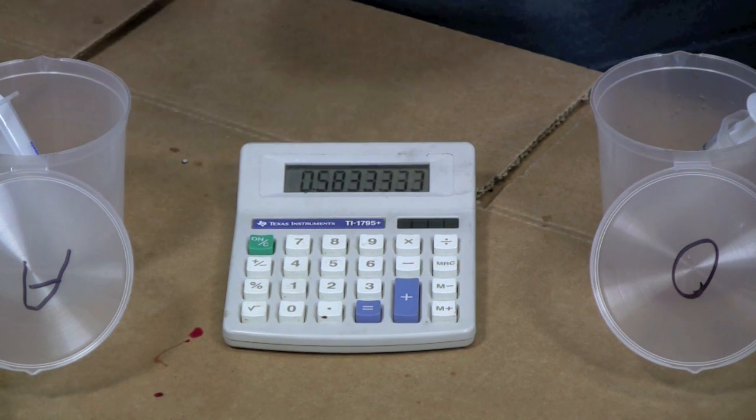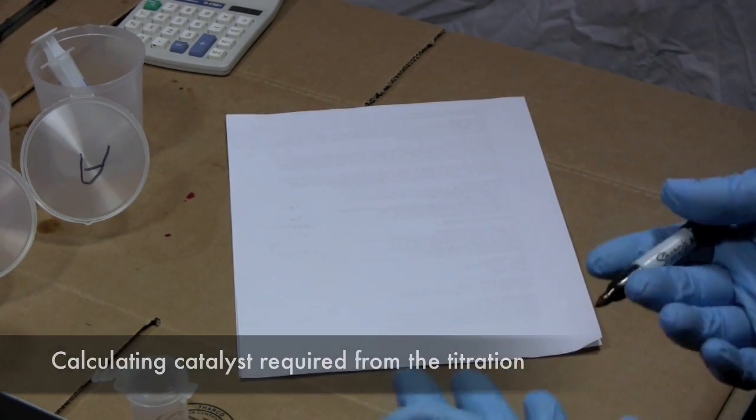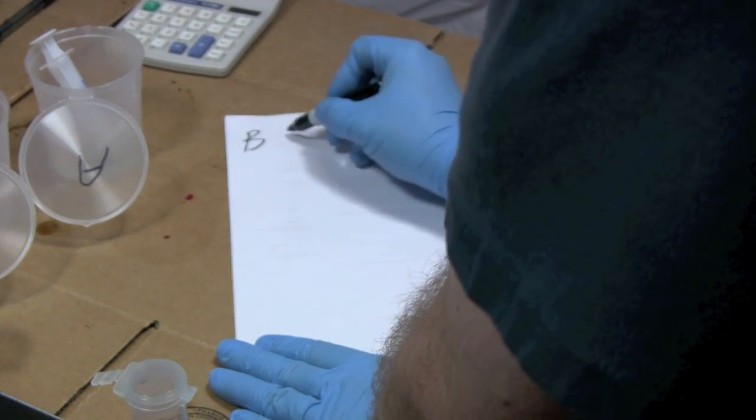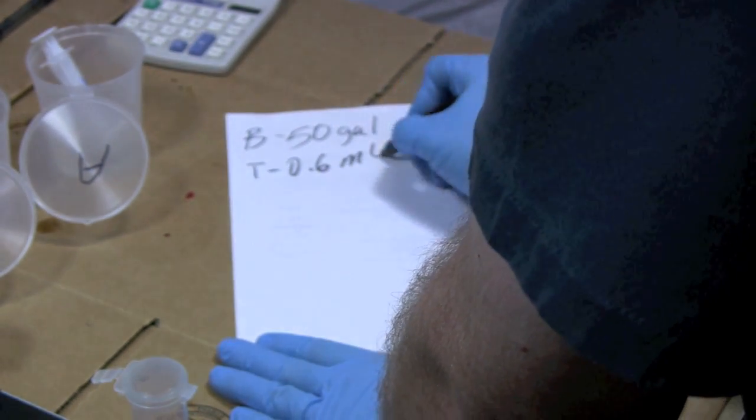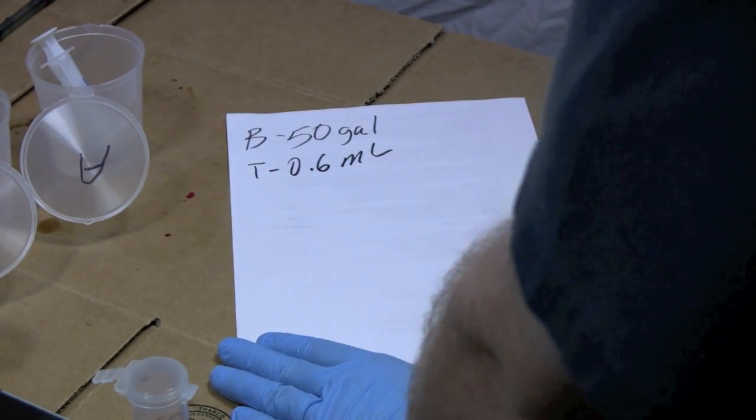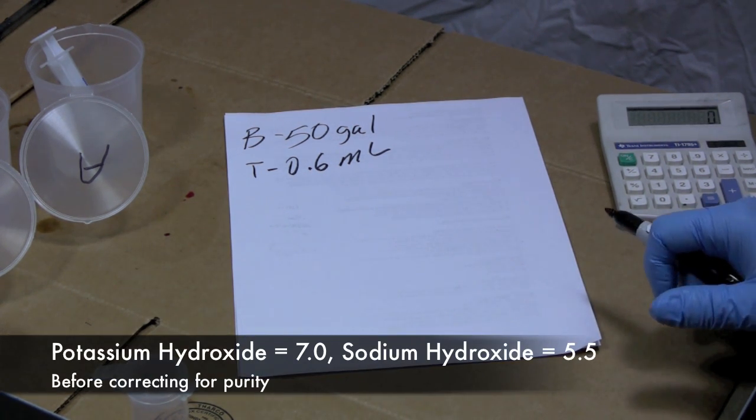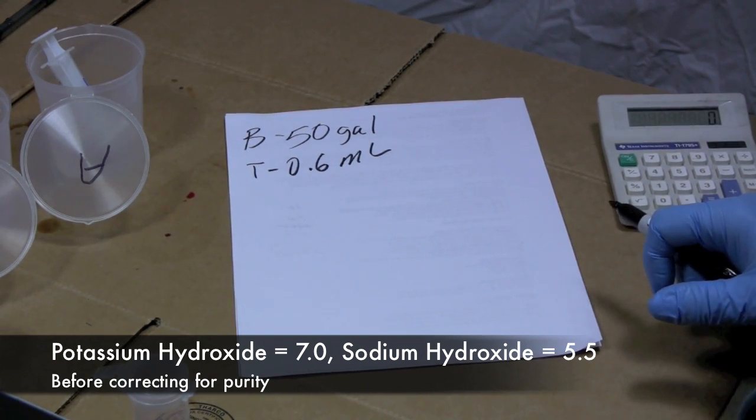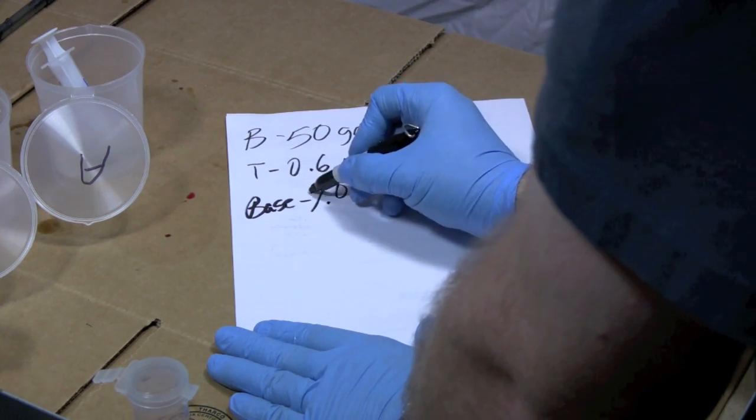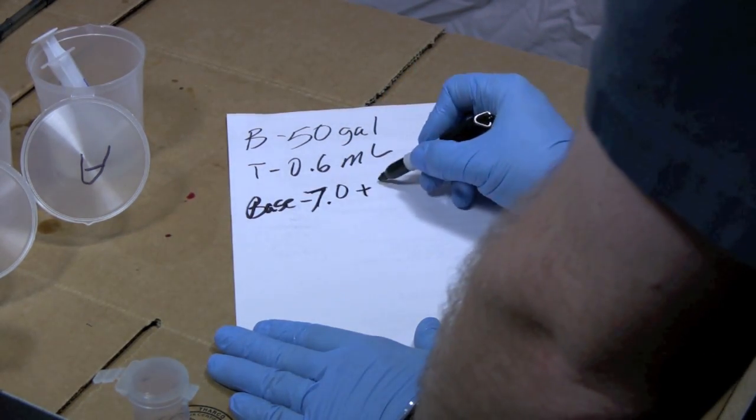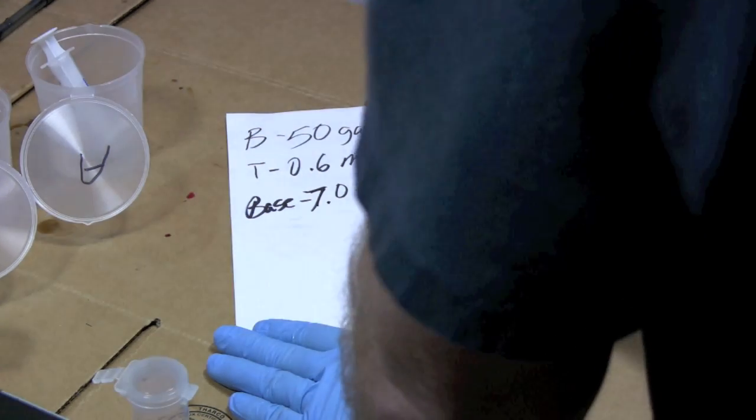Next we're going to talk about how we translate that into making biodiesel. Now it's time to figure out how much catalyst we're going to use when we make biodiesel. We're going to suggest that we're going to make a 50 gallon batch. We know that this oil titrated at 0.6 milliliters. We know that if we're using brand new oil, it will take 7.0 grams of potassium hydroxide per liter of oil to make it. So I'm going to call this my base. To that base I add 0.6 because that's how much additional catalyst per liter of oil it takes to make biodiesel. I get 7.6.